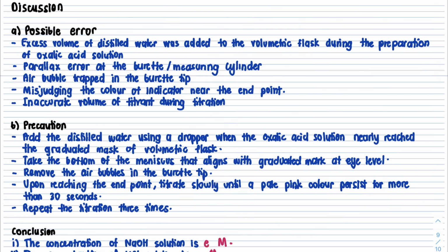So what is the precaution? Again, the precaution is that we have to add the distilled water using a dropper when the oxalic acid solution nearly reaches the graduated mark of the volumetric flask.